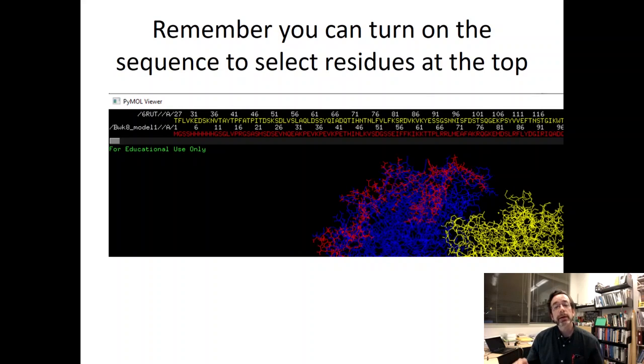You can go through here and you can click on all of your mutated residues, and you can make the selection out of them and color them all one color. You can make them space filling so they stand out. You can do all sorts of things. Remember all the stuff you did at the tutorial week? That was for a purpose, so that you can do this on your own, training wheels off this week. Training wheels not entirely off because we're providing help, but that's why you need to be active during your lab, because that's when we can provide help right away.